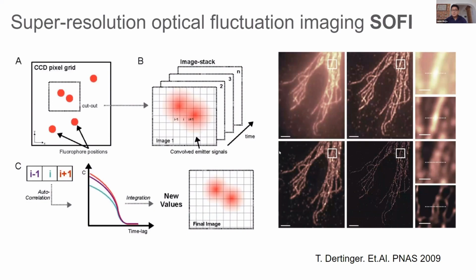Moreover, it has really good results. You can see this is the original image. And then by applying the SOFI analysis, you can increase the resolution and the contrast. You can go from here to here. You cannot even distinguish that there are substructures in here while you can do it in here. This is the part of increasing the resolution that is really important to us. Okay, I think that this is the very basic comment about SOFI.